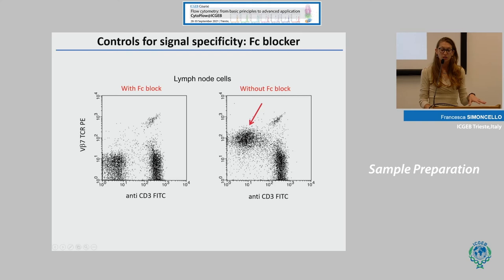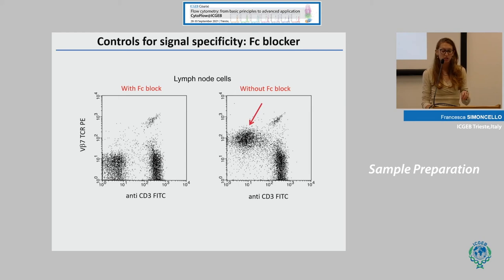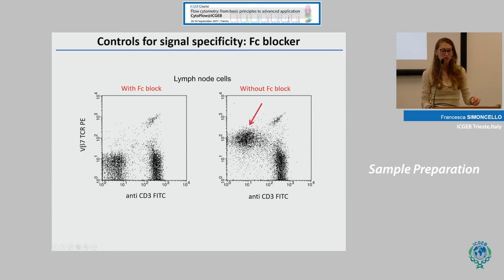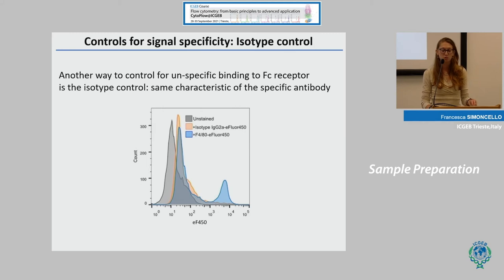As a practical example: in this dot plot you can see a population that is negative for CD3 — a T-cell marker — but positive for Vβ7 TCR, which is quite strange. You realize this population is just an artifact, because when you treat your cells with the Fc blocker reagent before extracellular staining, this population disappears. So it's very important to add controls for signal specificity during your analysis. Another way to control for non-specific Fc receptor binding is to use an isotype control.